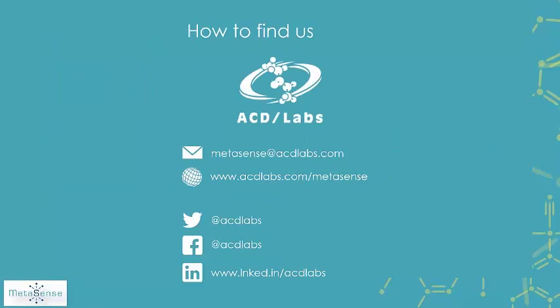The first is, can you customize the report template? The report template can be customized to a certain extent. So there are common elements that you, as a MetID expert or a DMPK group, may want to report out, such as the biotransformation map, spectra, and tables. The type of metadata that gets reported can be templated. The way things are arranged can be templated as well. So the look and feel can be customized.